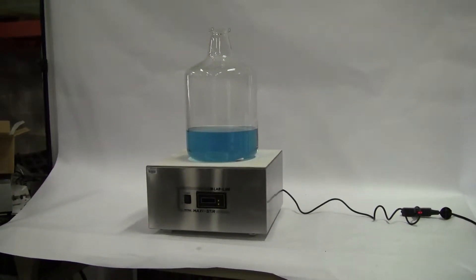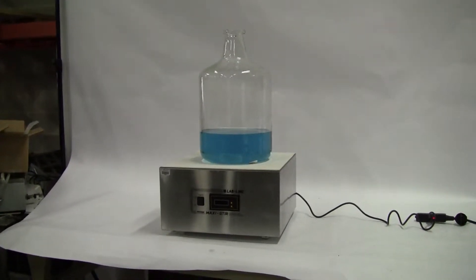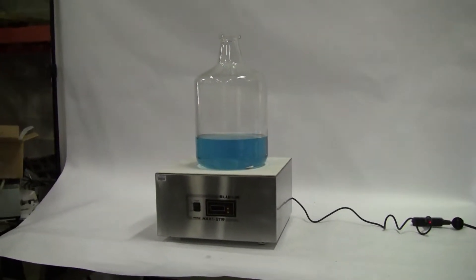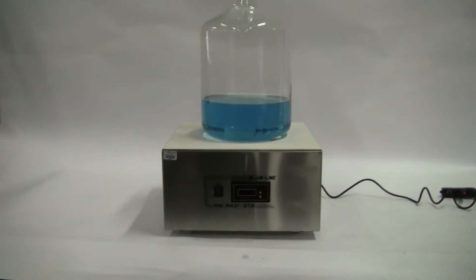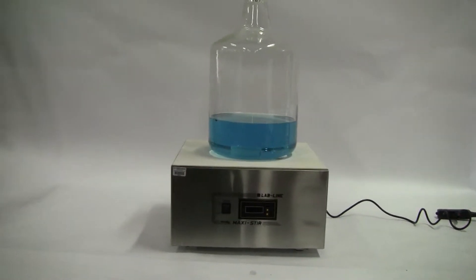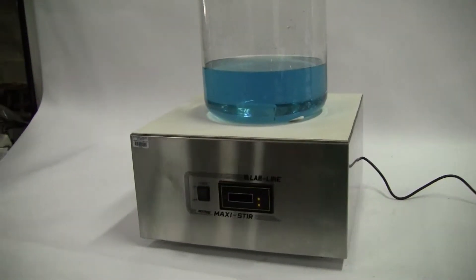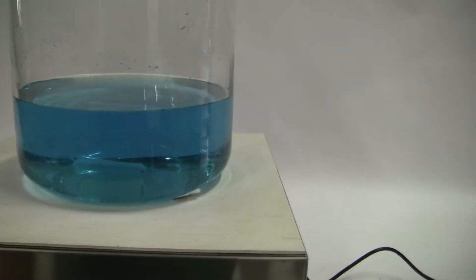Hi, this is Jim from HitechTrader. Today we're looking at a Labline Maxi stir model 1295. It's a heavy-duty magnetic stir. It's got a top of 18 by 18 and it has up to 2300 RPMs with the electronic control.